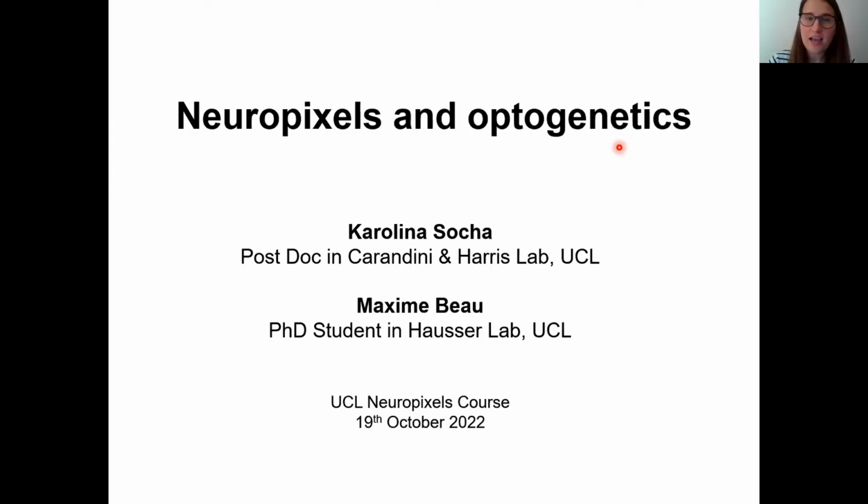Thank you, Andy. I'm going to start this session. As you mentioned about combining Neuropixels acute recordings with optogenetics, I'm going to focus mainly on how to get started, what to plan when for your experiments, and how to prepare the animals for acute recordings and optogenetics. And Beau will explain more about what to do with the data and discuss artifacts related to the light.